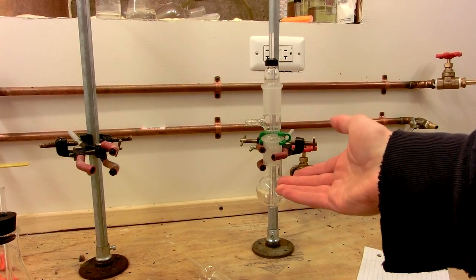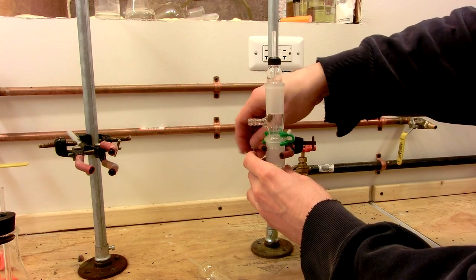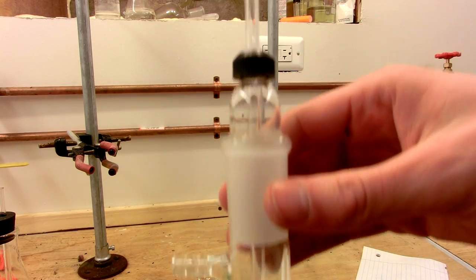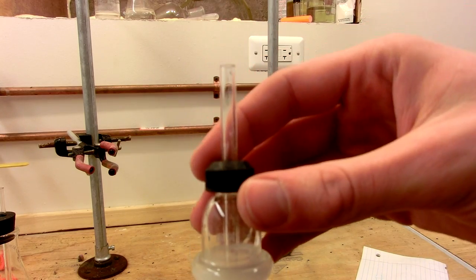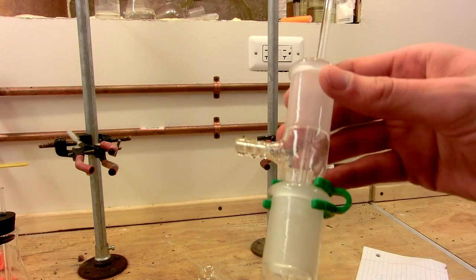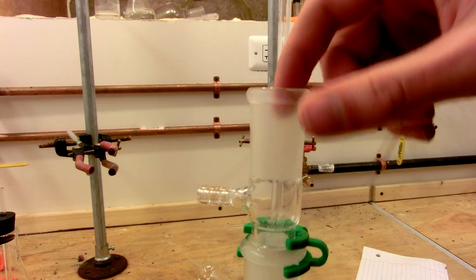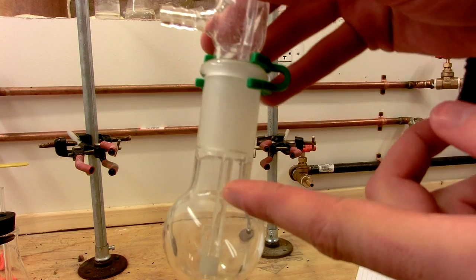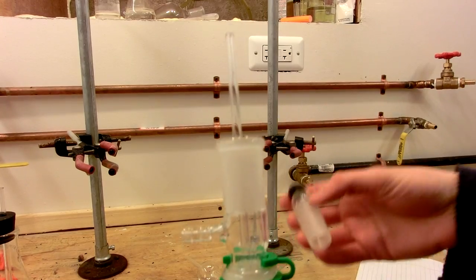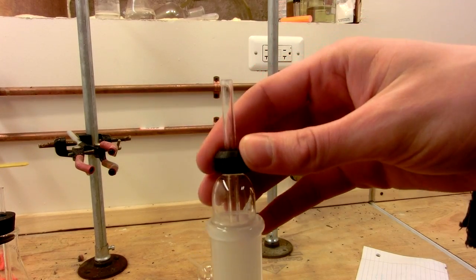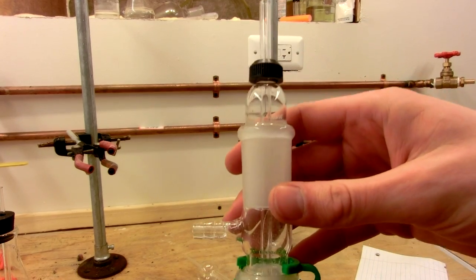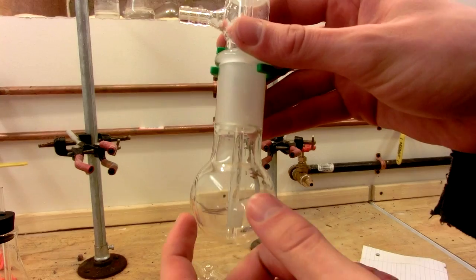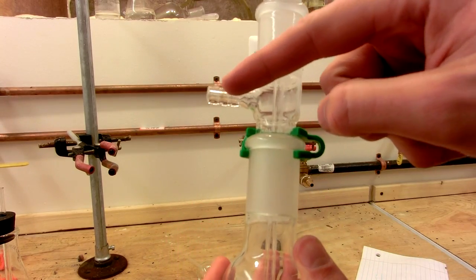Further, this right here is also an example of a gas drying apparatus. It's fairly simple in its construction. You have a 50 milliliter round bottom flask connected to a vacuum adapter, which is connected to a thermometer adapter, and a piece of glass tube in place of a thermometer. Now to load it, you remove the thermometer adapter, leaving the glass tube in, you charge your solid desiccant into the top, where it fills up to about here. Or you can use a liquid desiccant, like sulfuric acid, in which case you would charge it up to about there. And then you simply put your thermometer adapter back on, thread the O-ring down, and then cinch it to trap the glass tubing and provide a nice, tight seal. So, of course, gas is fed in the top, where it travels down the tube, bubbles through the liquid desiccant, or past the solid desiccant, and then comes out this tap over here.